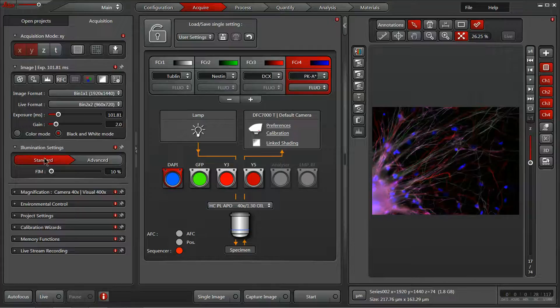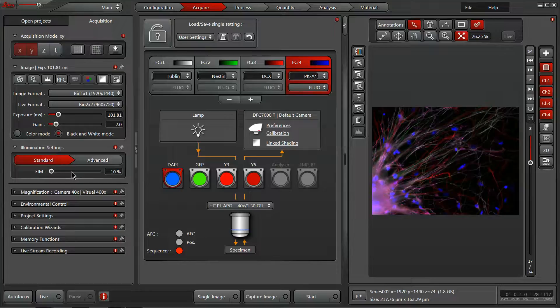Beneath that, we also have our illumination settings. On this system, we've got some automated excitation control, so I can control the amount of light that's hitting my sample.